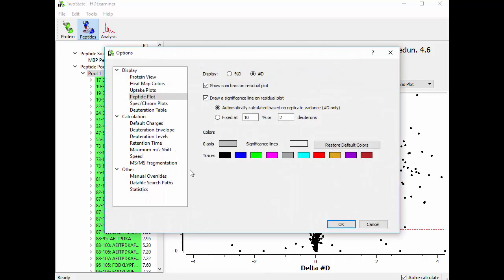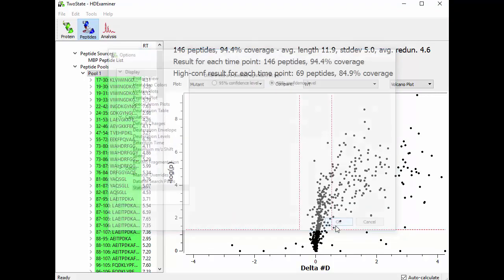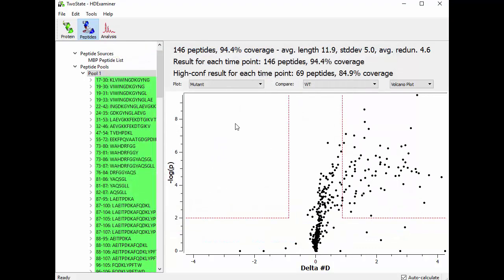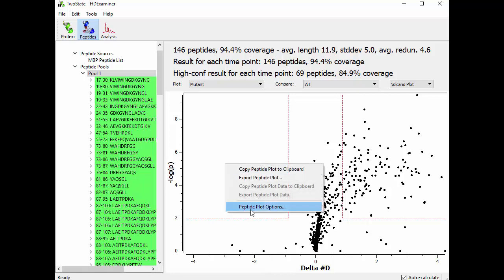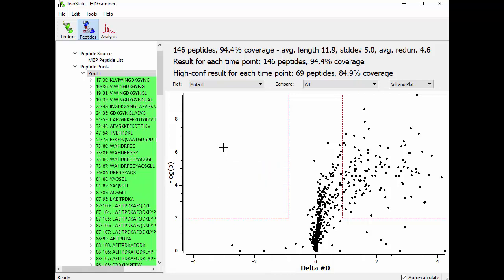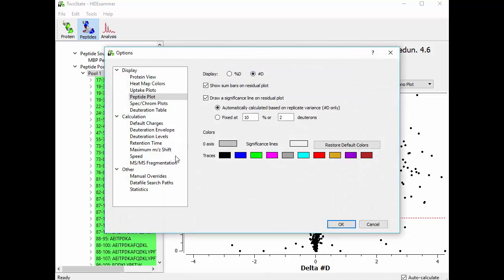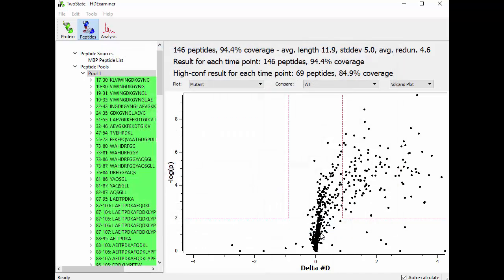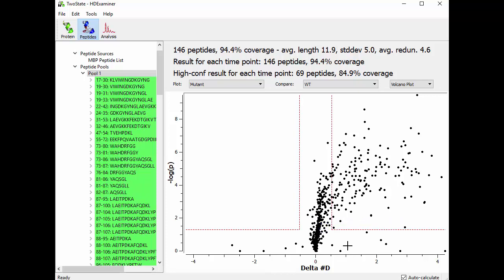if we go into the options under statistics, you can set this to 95 or 99%. So if you set it to 99, it redraws the volcano plot and now this horizontal line is at 2 because the 99% confidence level represents a P value of 10 to the minus 2 or lower. So let's put that back for a moment to where it was before.